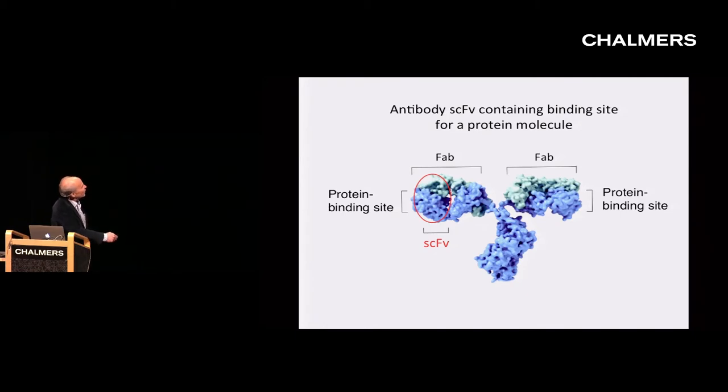Most of you will know that antibodies interact with antigens through the tips of their so-called Fab regions. The end of the tip can be individually produced in the form of what is called a single chain antibody fragment. Richard Lerner and colleagues have created enormous libraries of such scFvs in bacteria and in bacteriophage, from which such molecules directed against virtually any epitope of any protein may be derived. With their help, we have made scFvs directed against four sites on the surface of RNA polymerase II.